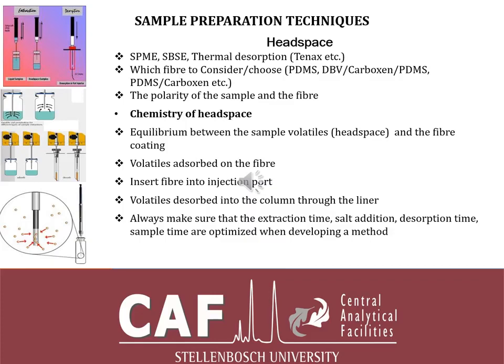From what I can remember, it was developed by Pat Sandra, and they had a student that was doing extraction for volatile compounds, and then when they injected into the instrument, they either lost the compound of interest, or the sensitivity was too low, and the student was panicking. Then Pat Sandra asked, what are the chances that the compound of interest might be retained on the stir bar, the magnetic stir bar?